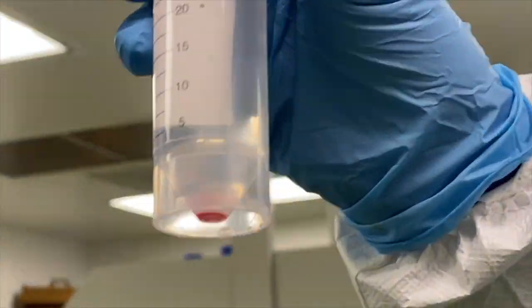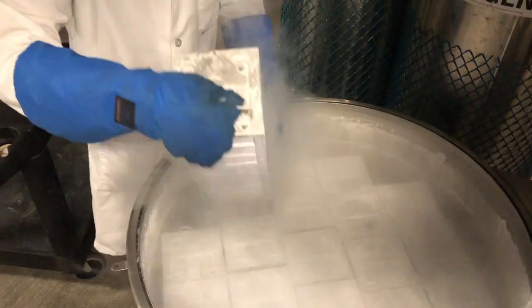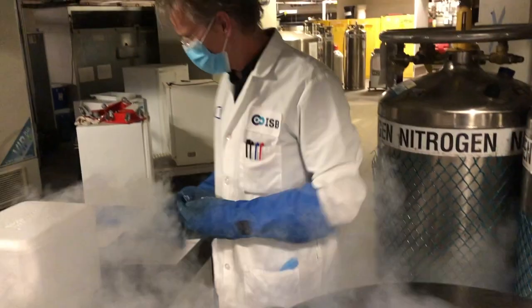And ultimately, that means that the biobank from which those specimens come has to be of pristine quality. And something that we pride ourselves on at the ISB is that our biobank is basically second to none. And in order to make a quality biobank, we want to go as fast as we can from the blood in the patient's arm to our cryo storage facility here with all the blood processing steps happening in between. To make that happen, there's several steps.